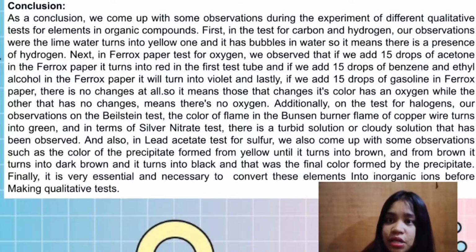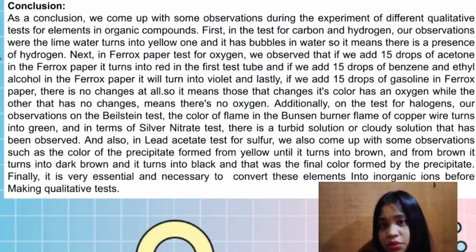Finally, it is very essential and necessary to convert these elements into inorganic ions before making qualitative tests.